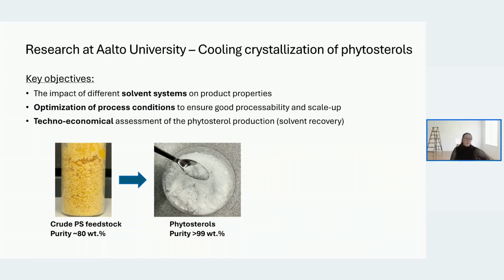We wanted to focus on cooling crystallization technology as a purification technology. And briefly about the key objectives of my work at Aalto. So first of all, one thing is to focus on the solvent system evaluations and how they are impacting the product properties.